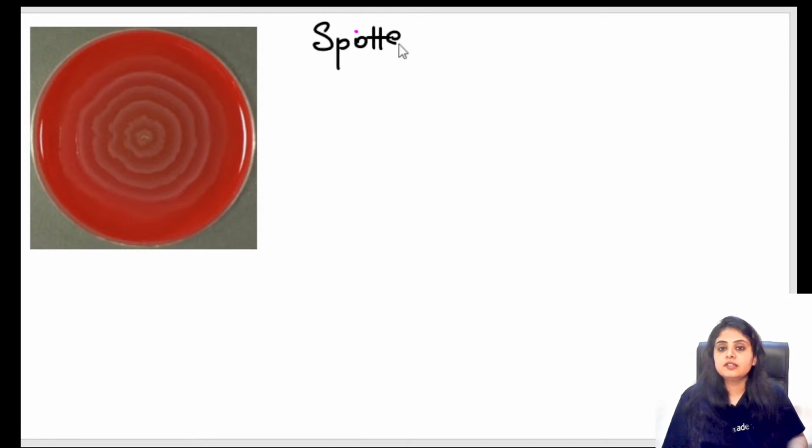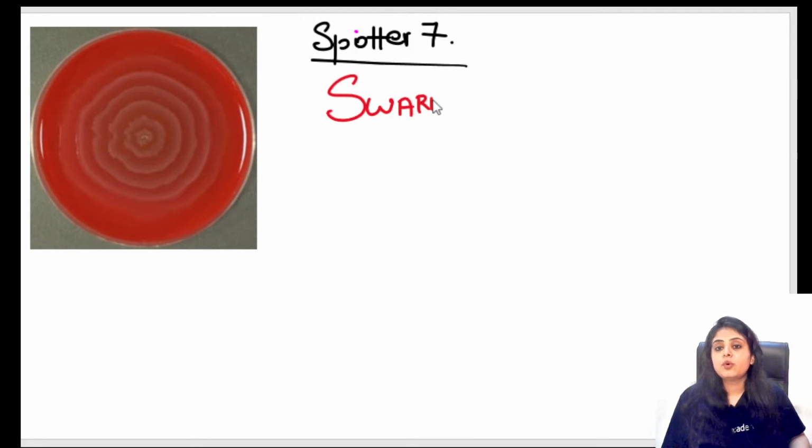What is this classical appearance known as? Primarily for the second years. What is this classical picture known as? Okay, so one answer awaited. 10 seconds. Excellent. You say, ma'am, this is a motility. What motility? This is a swarming motility.